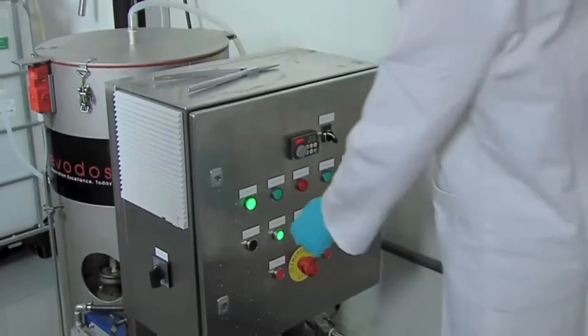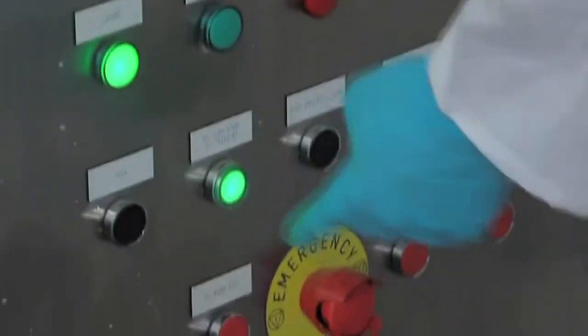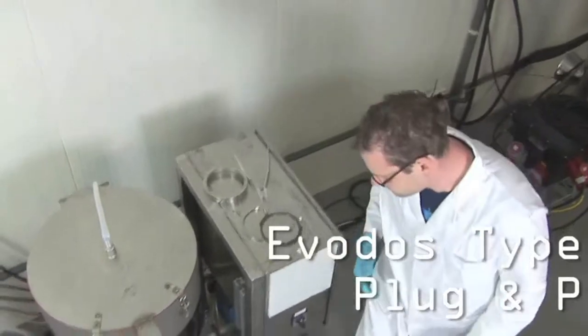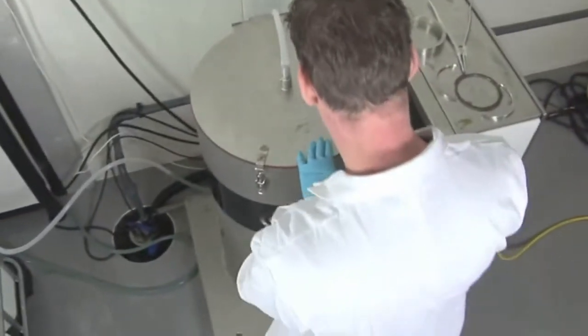The Type 10 is easy to operate. The machine is plug and play. You only level it horizontally, put in the power plug and there you go. Of course, the Evodos team assists you with the first runs. And they are always open for questions or recommendations.